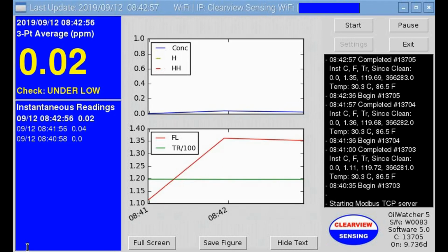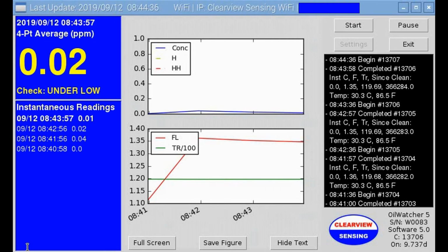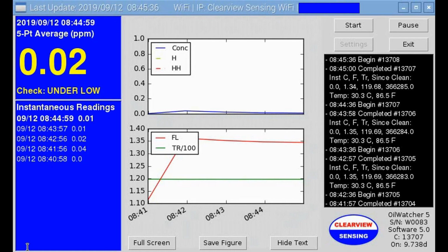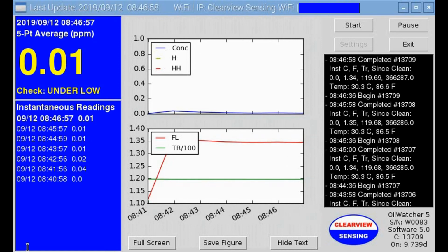OilWatcher measurements are affected by water properties such as chemicals added to the treatment process, solids and gas bubbles, and flow speeds. If these properties are stable and consistent, stable water mode can be used. If changes to these are expected, unstable water mode is the recommended setting. We'll look at updating the calibration in both of these cases, but first let's look at timing of a grab sample.